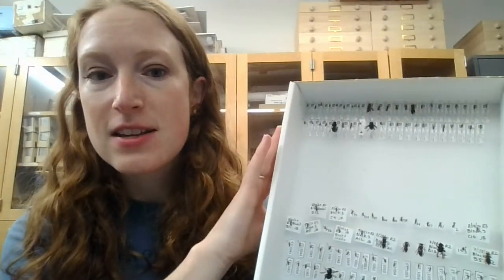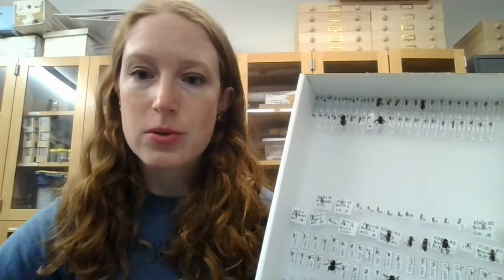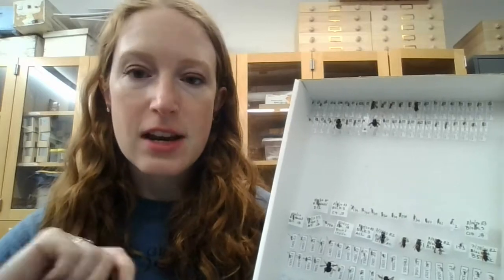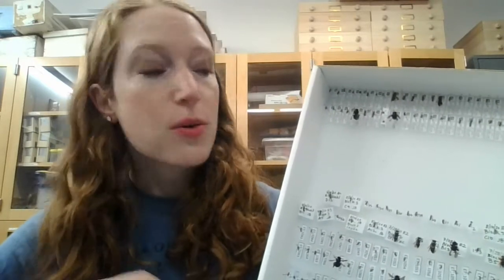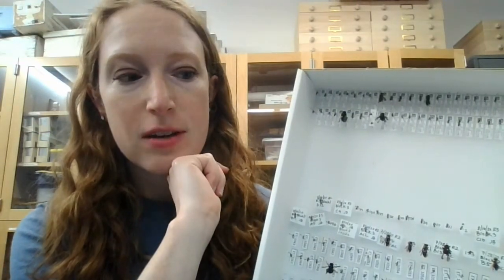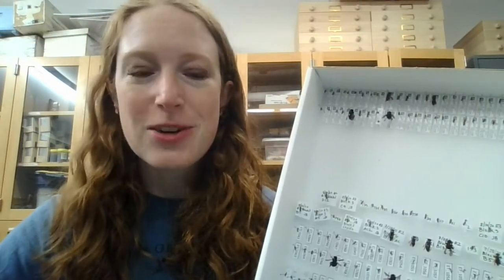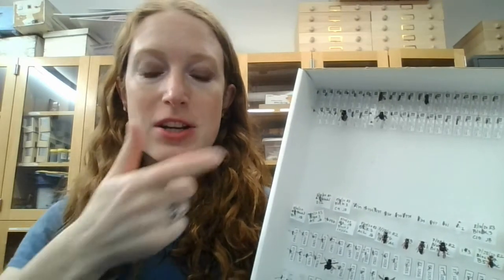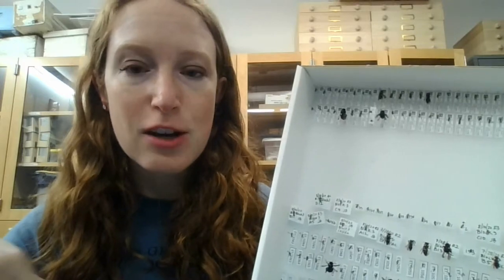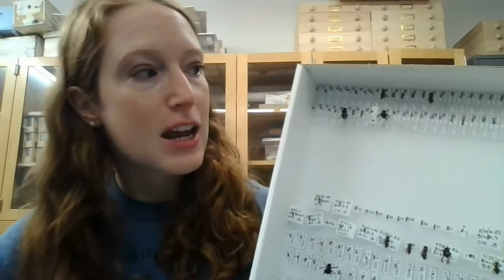But he takes these and then he starts to sort them out. So he'll put all of the bees that are the same species into the same little box, and then he'll assign species identifications to each specimen. Then we can go back through and scan the barcodes, which is a much quicker, more efficient way to get those species identifications entered back into the database. We can just scan the barcodes for all the bees that are the same species and copy paste that species name into the database, scan the next batch, etc.